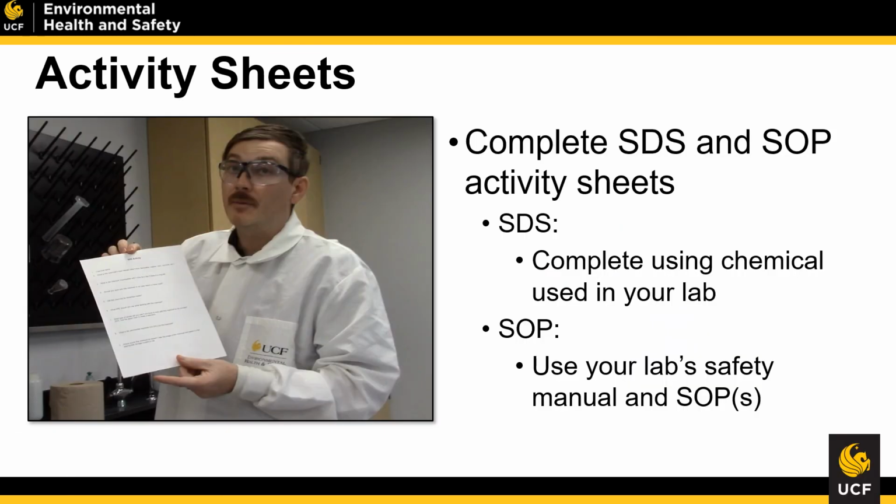As we start to wrap down this web-based learning module, I would like to remind you that you need to complete your SDS activity sheet as well as your SOP activity sheet. Remember, your SDS is your safety data sheet and your SOP is your standard operating procedure.